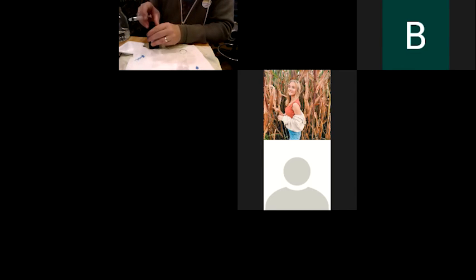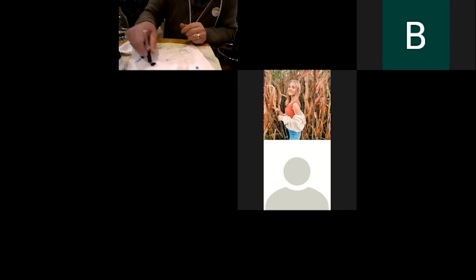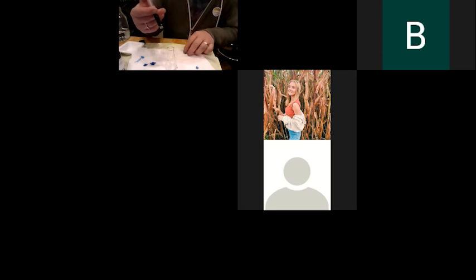Okay. So now I add DCPIP. Okay, there we got 5. All right. Let's see if we get a different color this time.